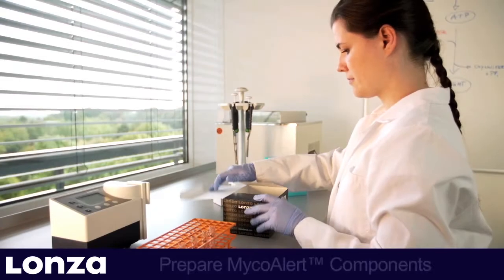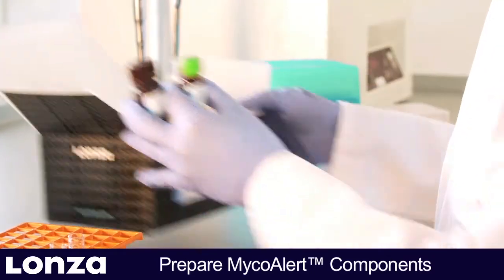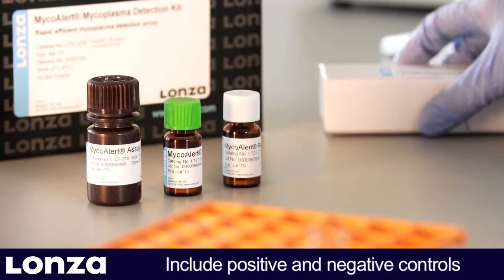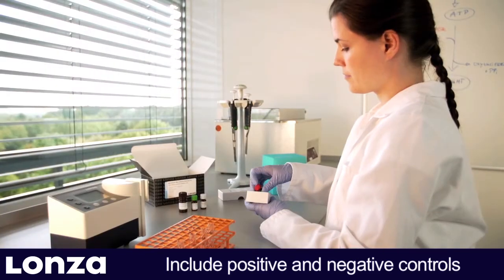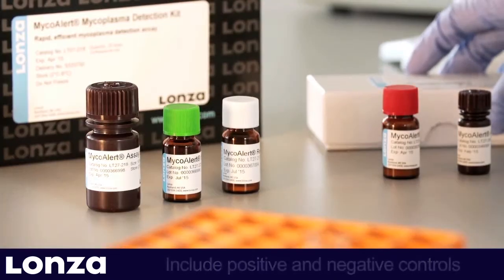As a next step, prepare the MycoAlert reagent, the MycoAlert substrate and controls. We recommend including a negative and positive control in every experiment. A MycoAlert positive control is available as a separate item. It does not contain live mycoplasma. The MycoAlert SA buffer serves as negative control.